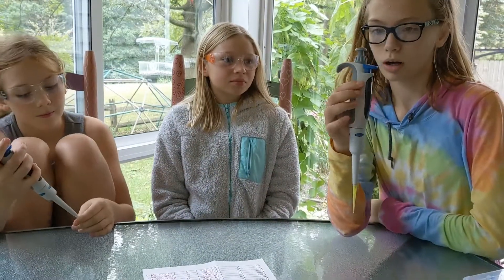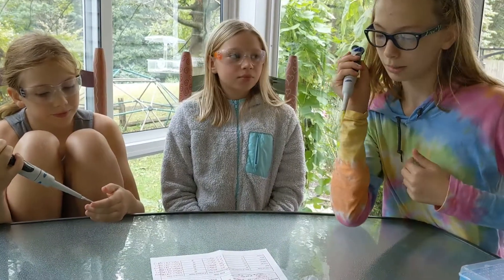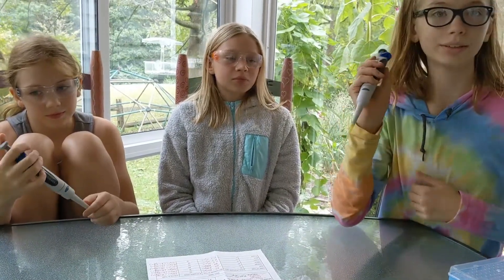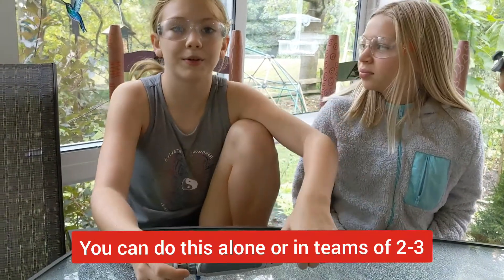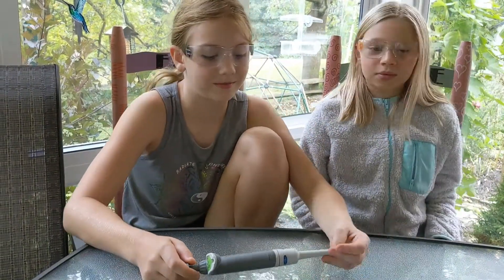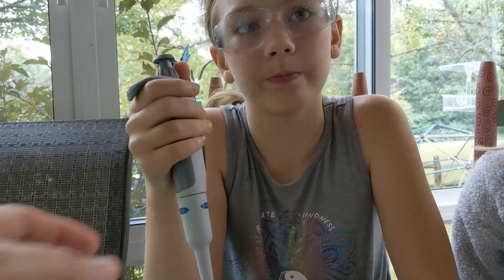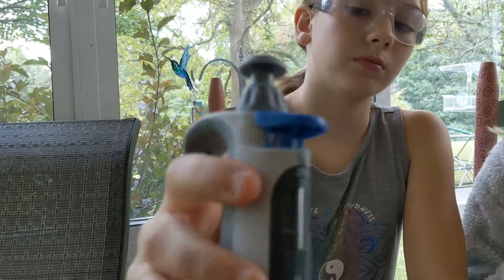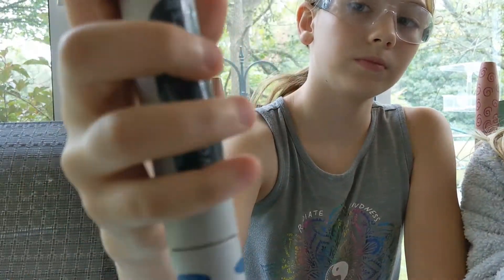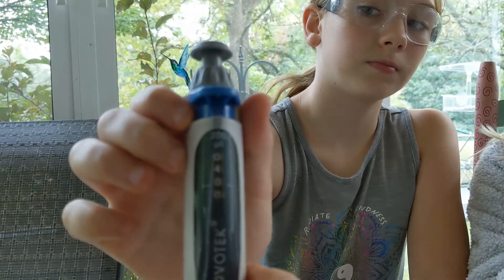We're each using a color with the big pipette and the little one. I'm doing purple and orange. I'm doing yellow and blue, and I'm going to be doing red and green. I'm doing red so I'm going to set it to 40. You turn the knob until it gets to 40.0.